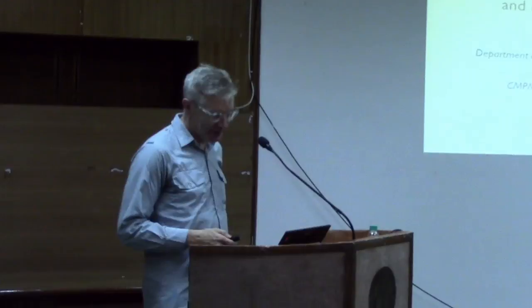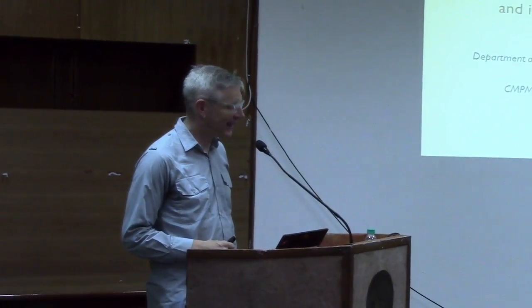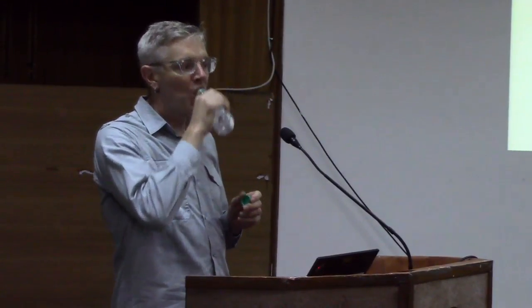So today I'm going to talk a little bit about how you measure data to get PDFs, and how you process the data to get PDFs. And then we'll have a hands-on session where hopefully you can install PDFgetX3 and try to do some data analysis yourself on some X-ray data. If you have some of your own data, then we'll try and help you process that as well.